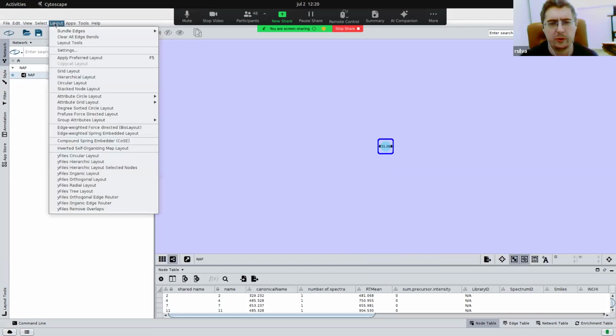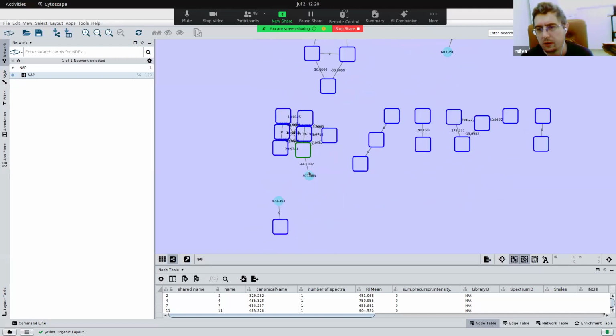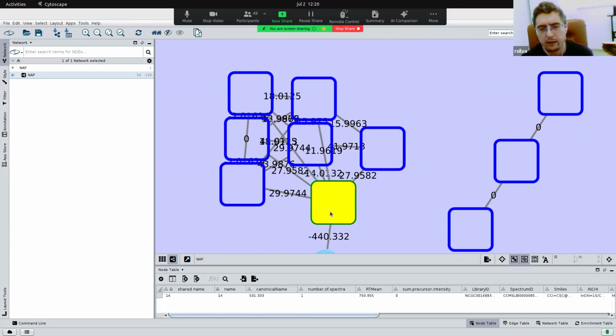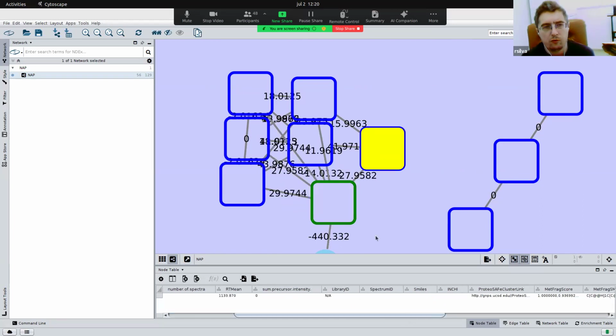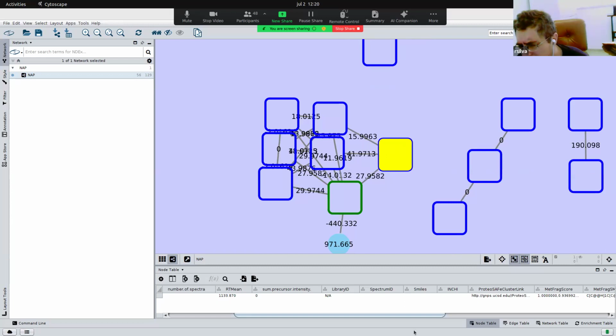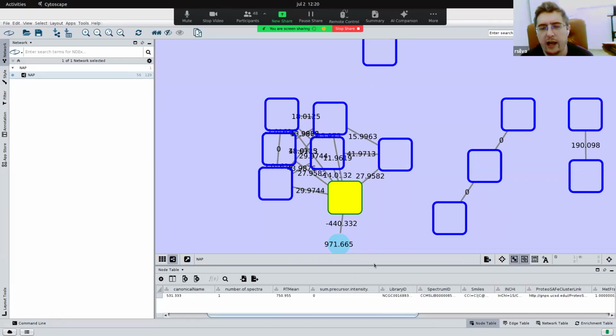So we did a custom layout for NAP. Basically the borders are different colors, right? We have green for spectral network match. We have blue for in silico fragmentation match here. And one thing is that even if the node has a spectral match, it has to have the structure to enable NAP or ChemWalker to propagate the information. I think early on, when people used to deposit data, many people did not provide the structure, right? So it does not help the propagation.